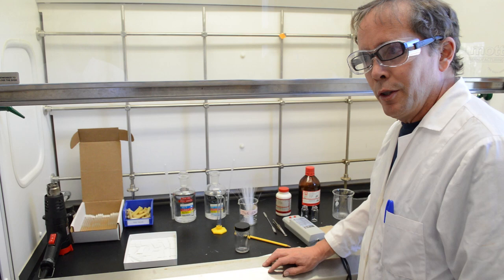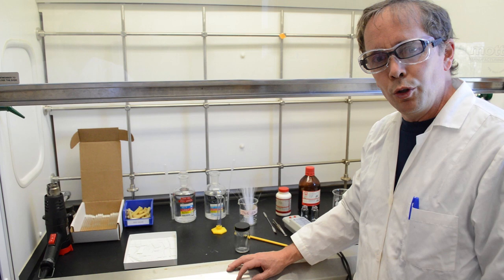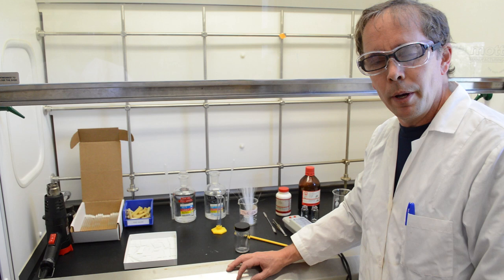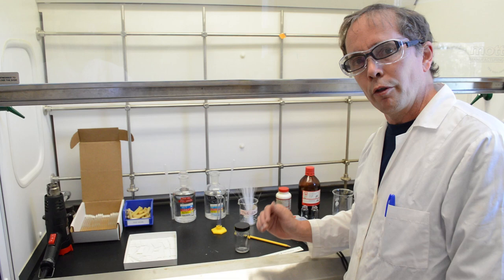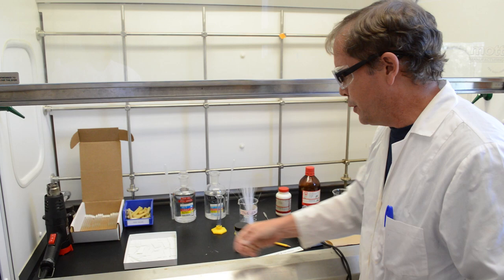Today's video is on thin layer chromatography. Thin layer chromatography is a very useful technique. It can be used to identify a compound in a mixture, to assess the purity of a compound, and most importantly it is used to monitor or follow the progress of a reaction from starting materials to products.